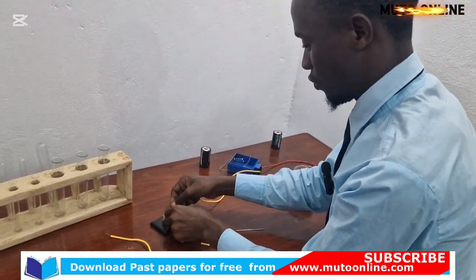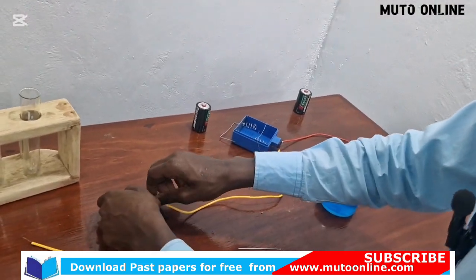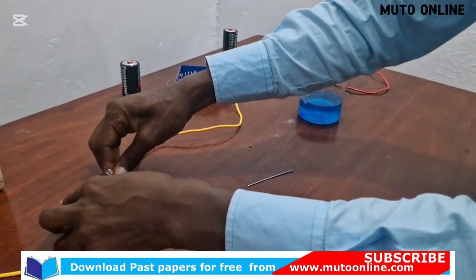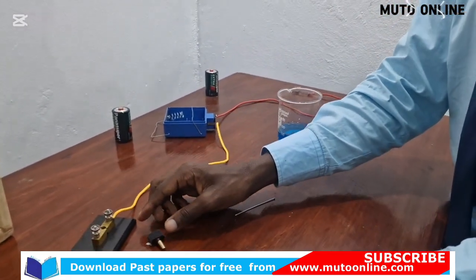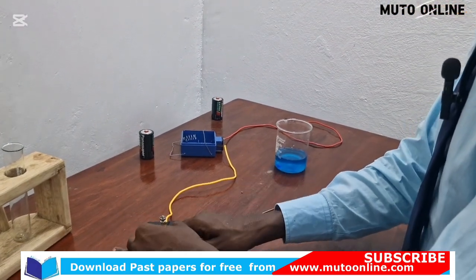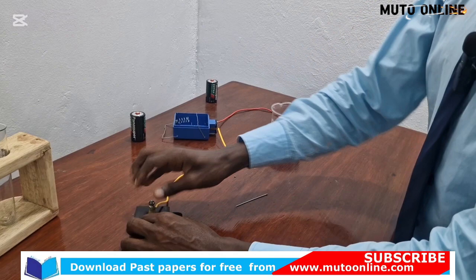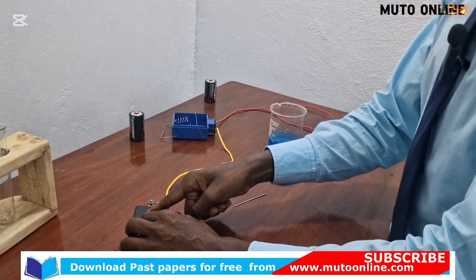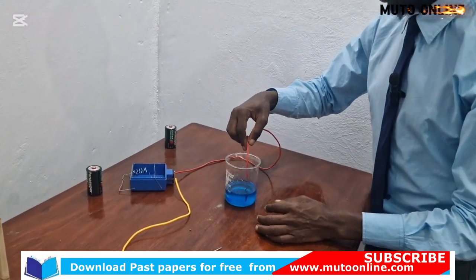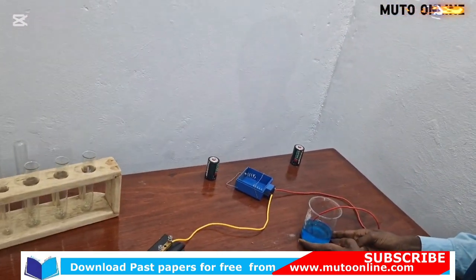I'll connect this to my switch. Yeah, I'll make sure all the wire is on this side of the switch. And then from the switch, I will connect. So there is a gap here that needs to be completed. So I'll make sure this is my anode. I will immerse it into my electrolyte. So this copper sulfate is my electrolyte.